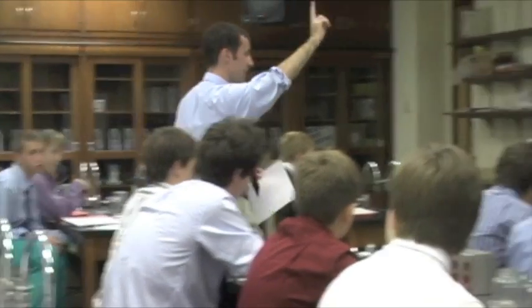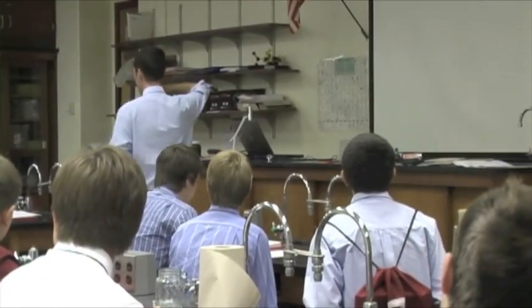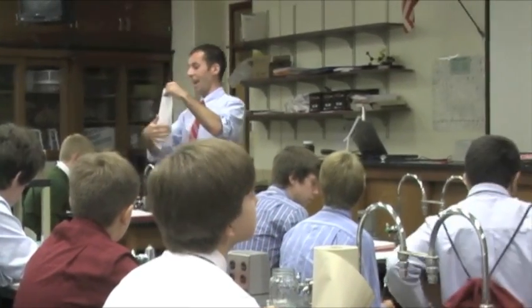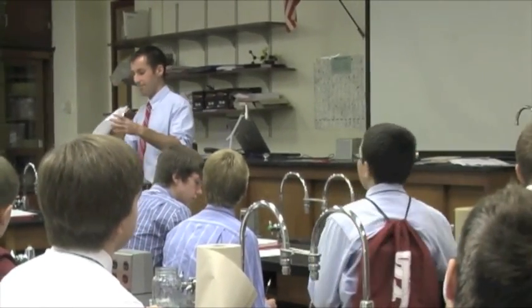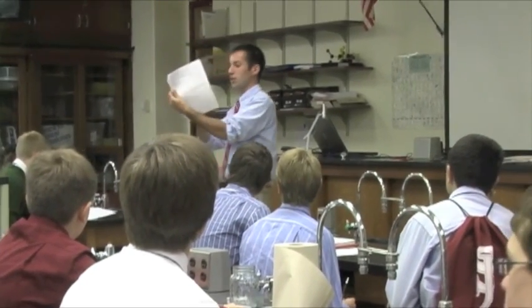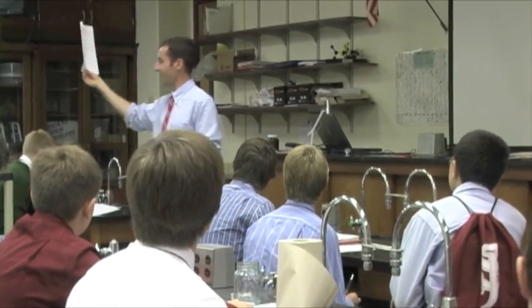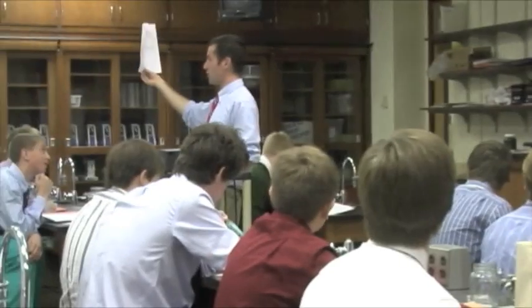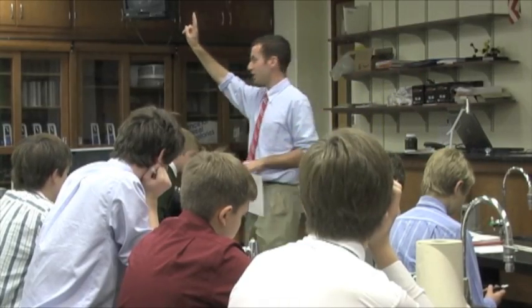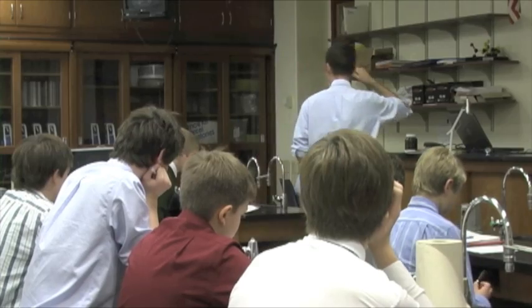The first thing you need to do is read through this, answer the questions, and then on the back side of this sheet, there's one more question that you answer as a group, and then you come up with a short plan as if you were shooting a video to show your responses to the question. The second thing you need to do is prepare your sample of runoff water.